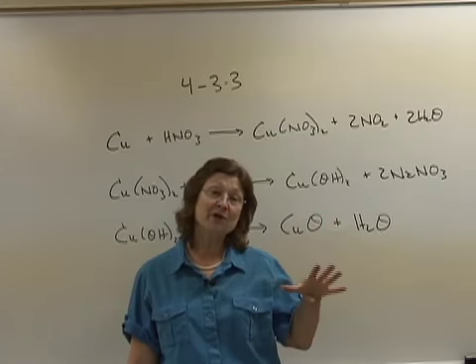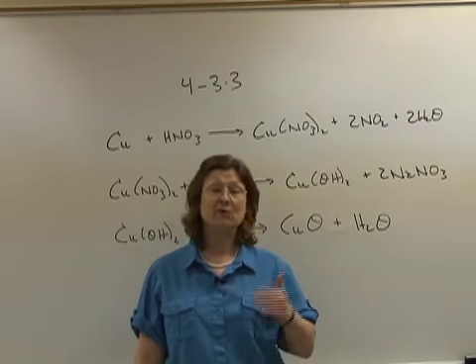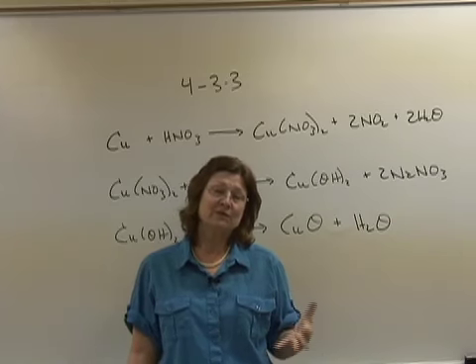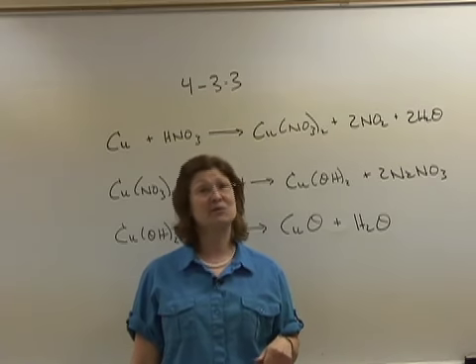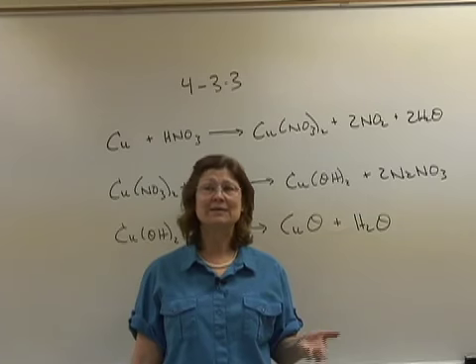If you look at the very beginning of your lab, there are 5 reactions given to you, and we're going to discuss a little bit about those reactions before we begin the lab. Number 2 asks for some of the terms to see if you understand them. It's always a good idea to look at a dictionary if you're not sure what the terms are. One of the terms is to decant. What does that mean?